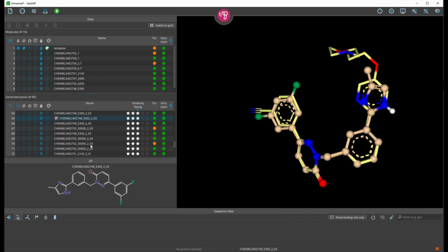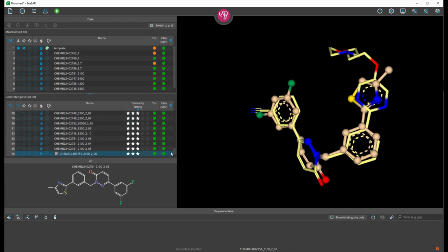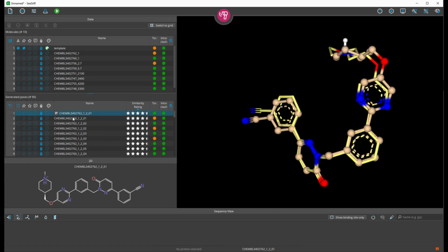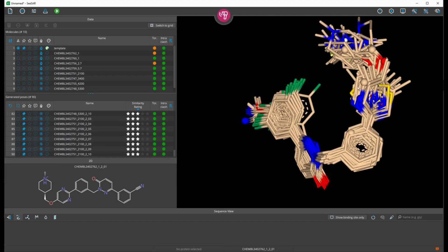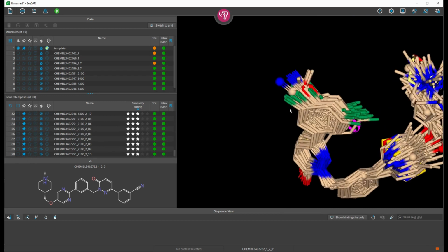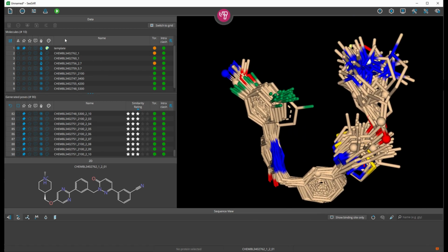We also notice that in this particular example, the actives align much better to the template compared to the inactives, which in this case easily supports the crux of the similarity property principle. Please note that this may not, however, always be the case with your experiments with the Similarity Scanner.